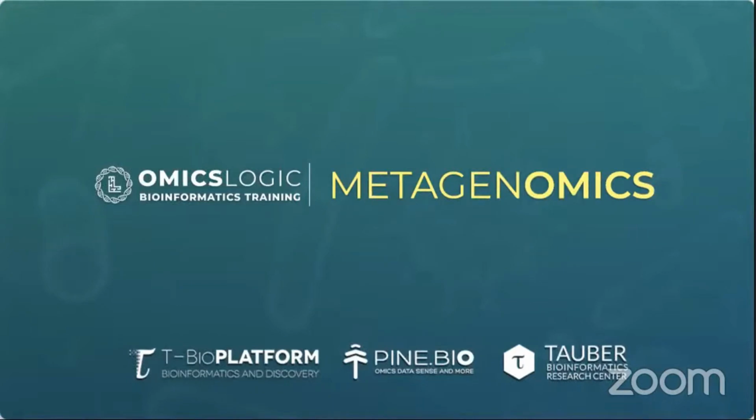So before we begin, let's see the different areas to which we can relate the metagenomics data and information, and ask important questions about these microbial communities, and also review a couple of studies that are used to characterize microbiota from different sources.